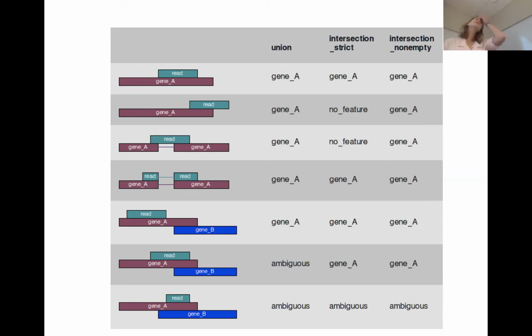So it is part of an independent Python package called htseq. You can use pip. Have you ever used pip? It's like a Python installer package. Or if you manage your Python environment with Conda, you can use Conda to get it. But it's an independent package. It's easy to find. It's called htseq.